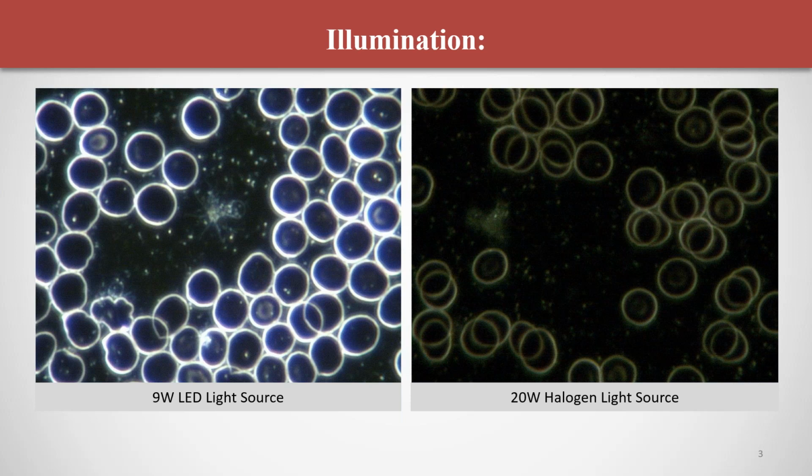And crystals? Crystals you can see. So in the system with the 20-watt light source, you will see some crystals. They're very large, and the crystals we can see in Brightfield as well. An important one though with this system on the right-hand side is your white blood cells.